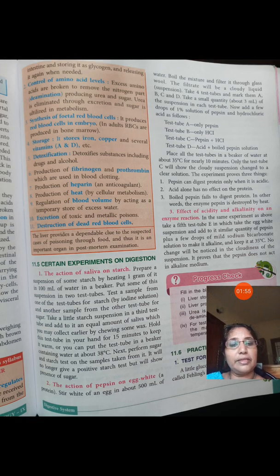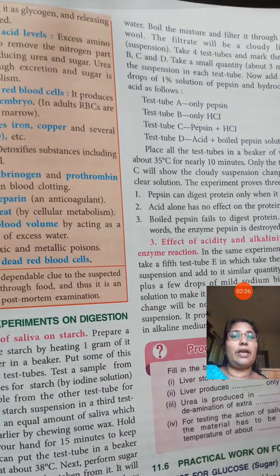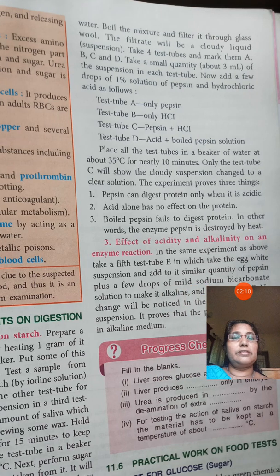Then another experiment is the action of pepsin on protein. We know that egg white contains protein. So we can take a small piece of boiled egg, or we can make a cloudy solution by putting the egg in hot water. We can make a cloudy liquid of the egg white, take a small amount from it, and add pepsin into it. Ready-made pepsin is available from the laboratory, and in the markets.